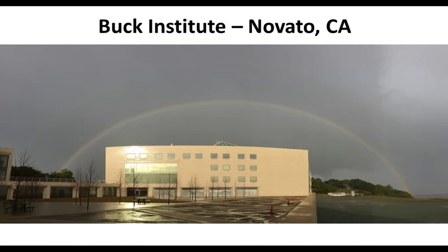Yeah, so I think Birgit is absolutely right, and I would just add to that, whenever we're preparing one of these PTM or motif antibodies, our goal is always the broadest coverage possible, or to generate something that really is context independent and only dependent upon the presence of that PTM. All of these products are monoclonal products, but what we'll actually do is take clones that we get, test them via ELISA, or actually test them in PTMScan, and look at the peptides that we get out of each of those individual clones, and in some cases combine multiple monoclonal clones into one product.